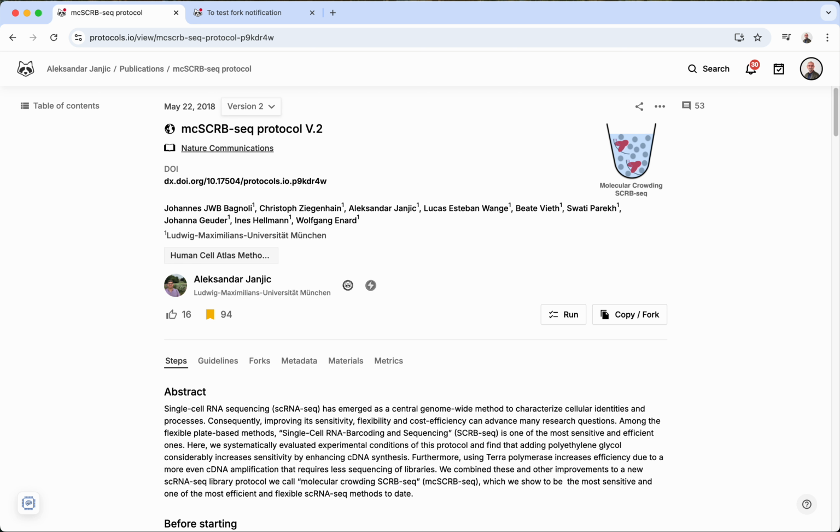In this tutorial, I will explain how to add a manuscript citation to a protocol. A protocol that has been reported for the first time in a peer-reviewed paper can be linked to that paper by using the manuscript citation window.